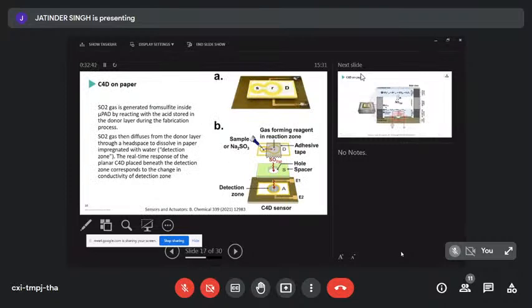So we'll be playing around with paper fluidics as well. This is a paper by Peter Houser that I did work with. What they've done here is they combined a conductivity detector. The electrodes are not in contact, so it's called the capacitively coupled contactless conductivity detector, which is a bit of a pain to say, and that's why we say C4D, because there are 4 words with a C before we say detector. So the C4D sensor here is one of the things you're looking at.